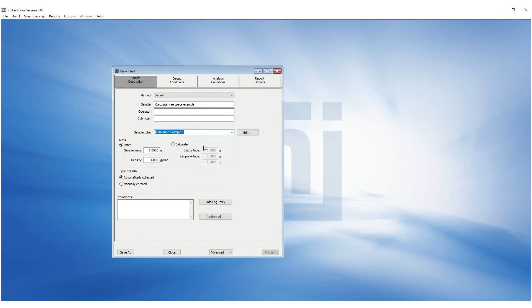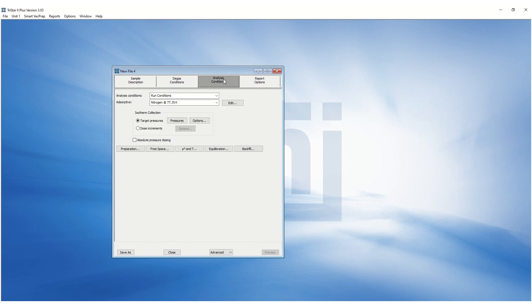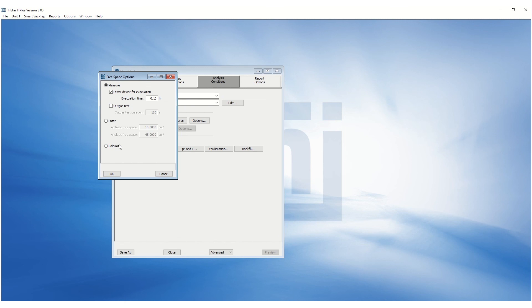Next, enter the sample mass and the density of the sample. And finally, under the Analysis Conditions, click on Free Space and make sure it is set to Calculate.